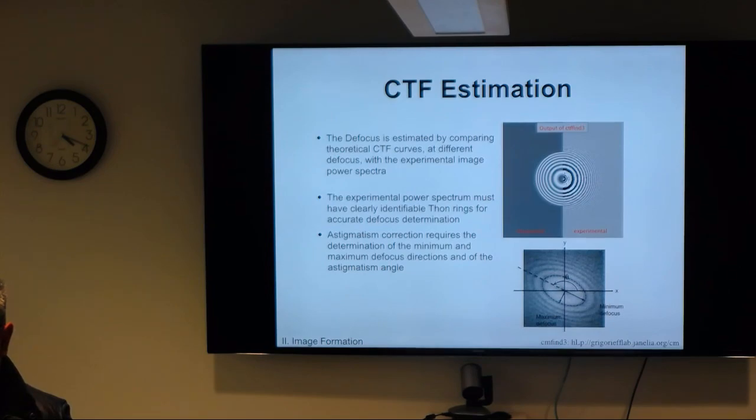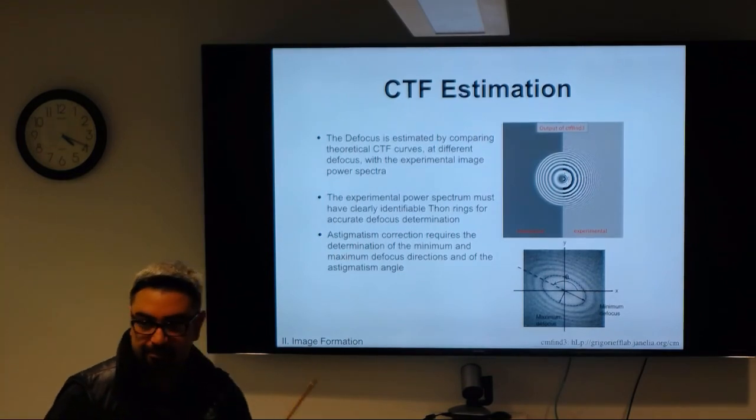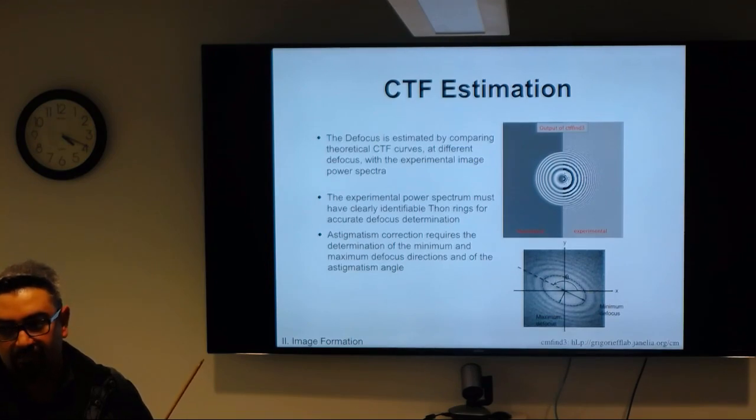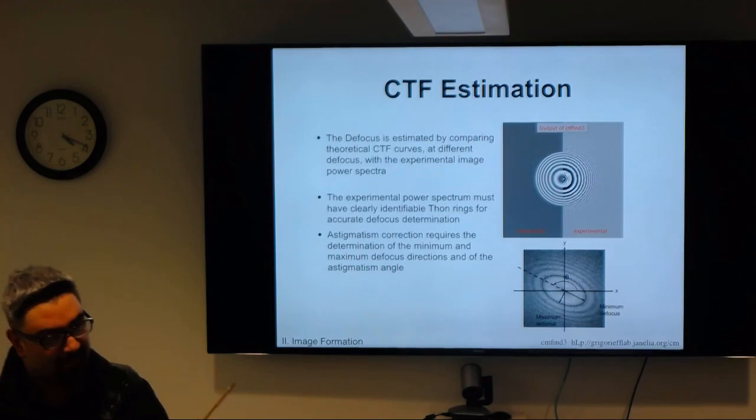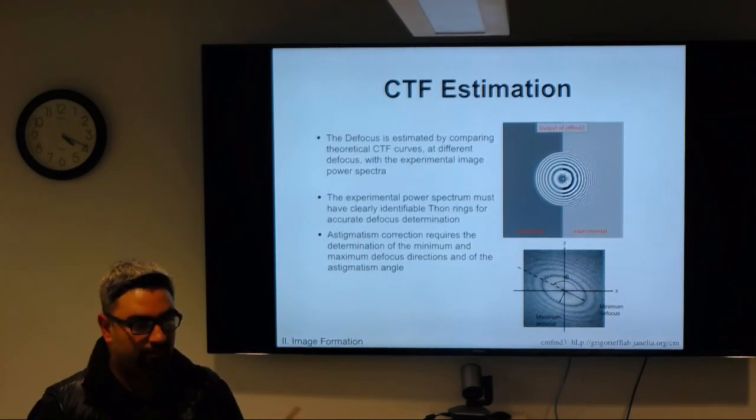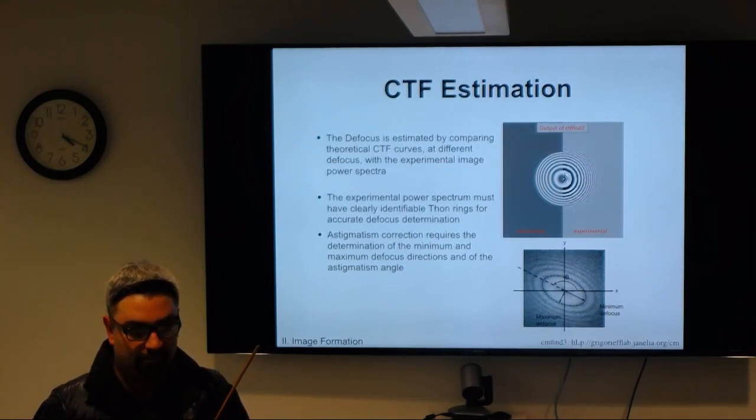Say, between these values that you've given me, I'm going to randomly pick one for each of them. Perfect, great. And you can also sort based on the focus value. All of that metadata is tied to the image, so you can get rid of images that have certain focus values. But I think in the FEI EPU software, you give it 3 or 4 values or a range of values, and it does step through those values. But we don't use that.